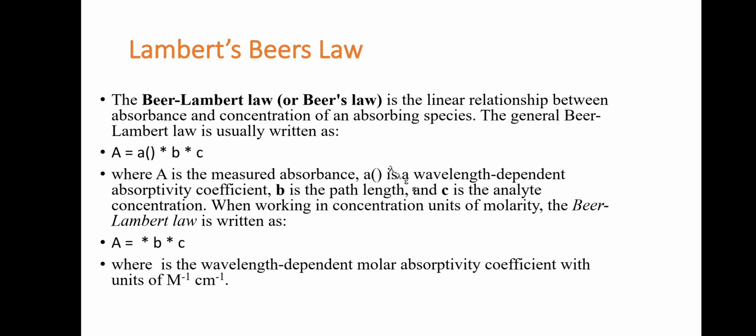So now we discuss the Lambert-Beer's law. This is a very important law in spectrophotometry. This law states that there is a linear relationship between absorbance and concentration of an absorbing species.